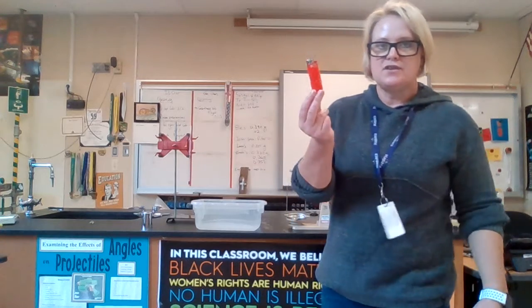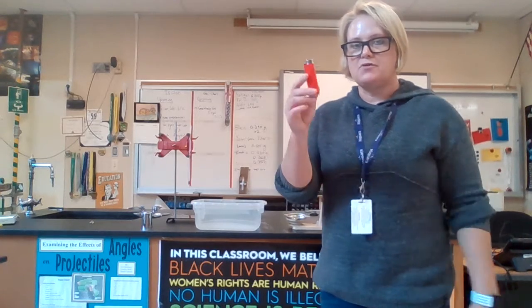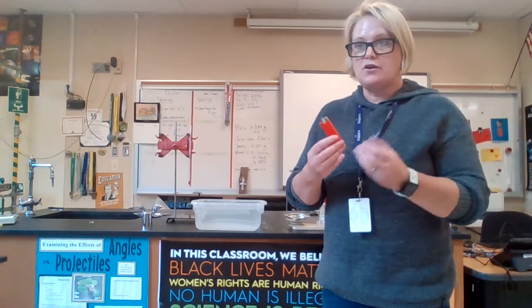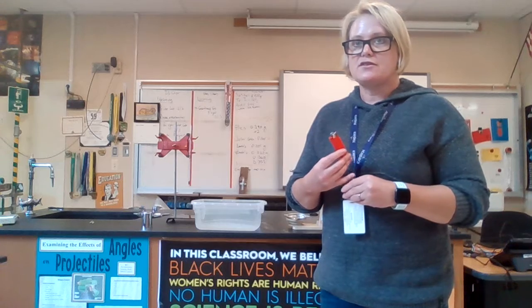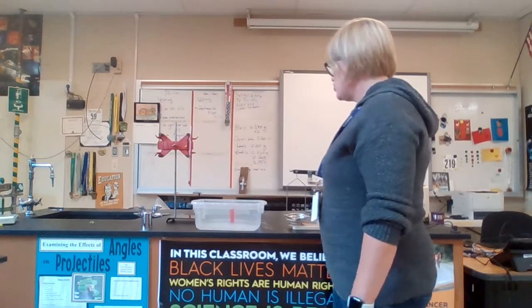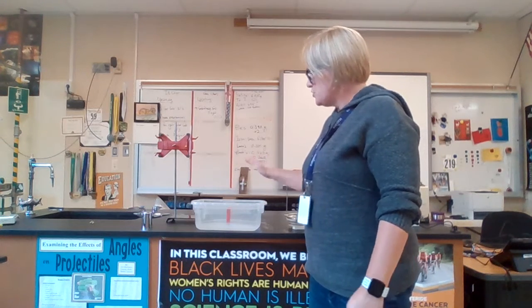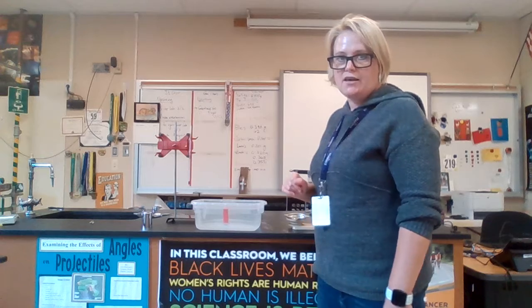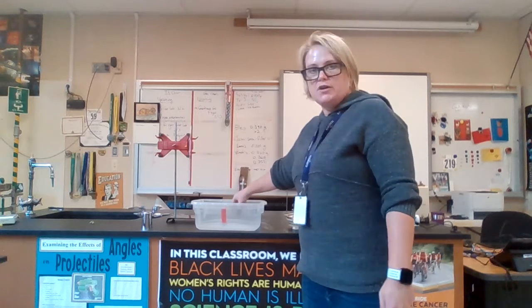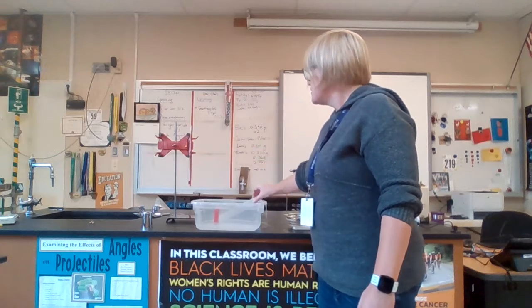A typical lighter is filled with liquid butane. It's at high pressure until I open up the valve. That increases the volume and depressurizes the gas and turns the liquid into a gas. I have it in this jug of water here, so it becomes the same temperature internally as the water in this tank. I've got a graduated cylinder that I'm going to use in a few seconds.